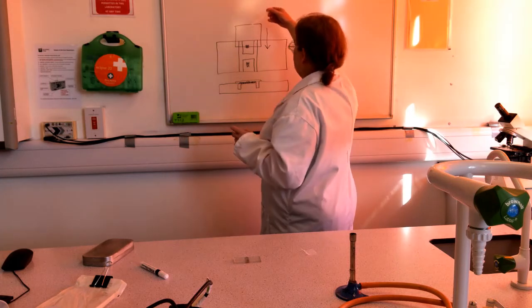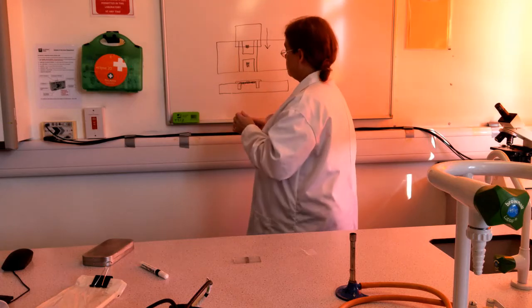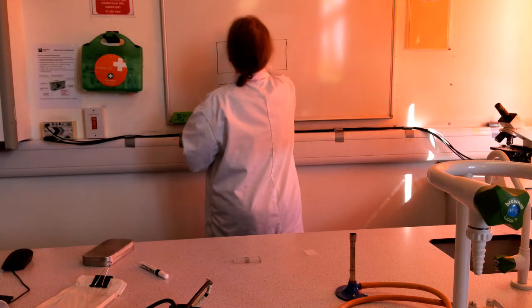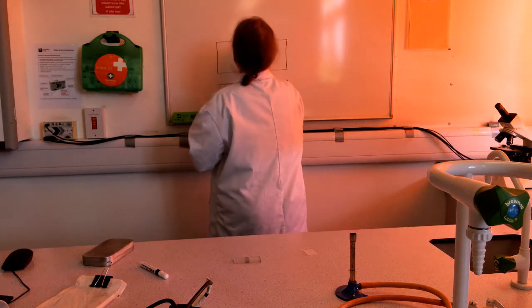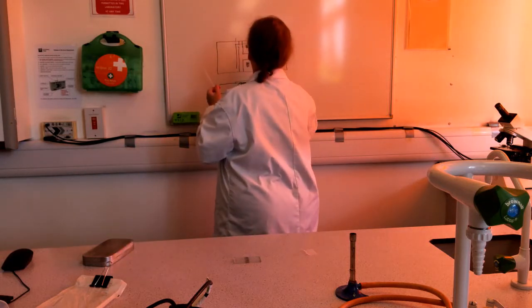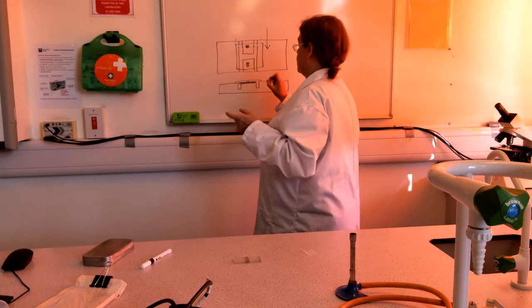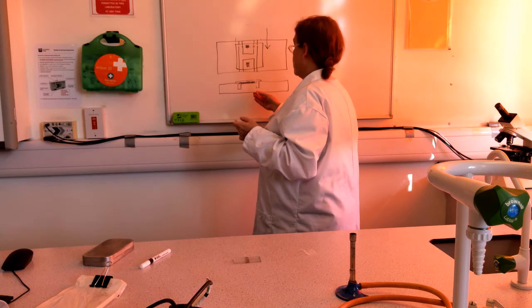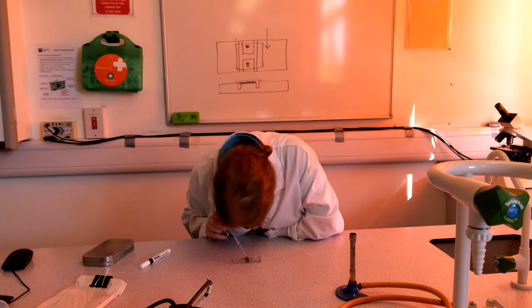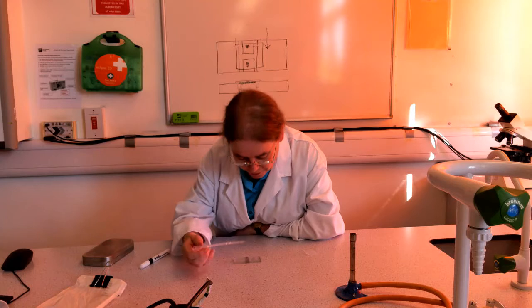Literally, all you have to do is put your pipette there. I've now got my cover slip on. It's here. And all I have to do, it doesn't sound as if it would work, but it does, is put my pipette there, touch it to the edge of the cover slip, and let a tiny drop of water out. Like so. And to everyone's amazement, it sucks itself under.